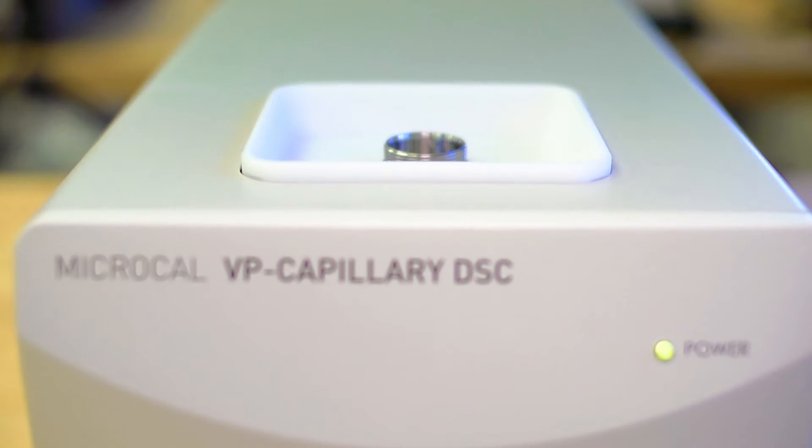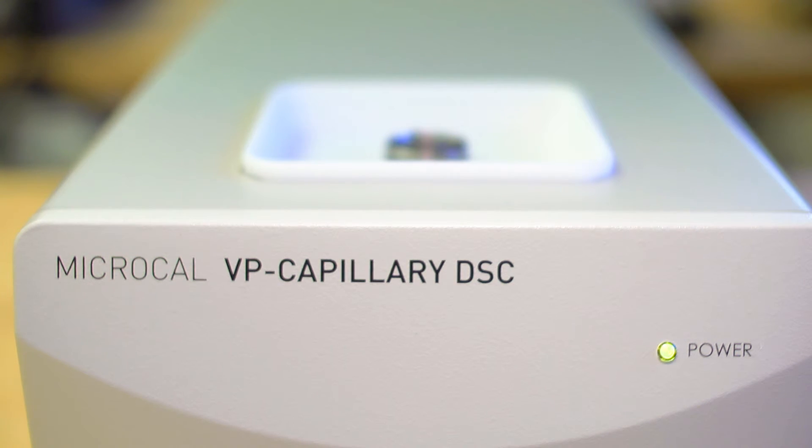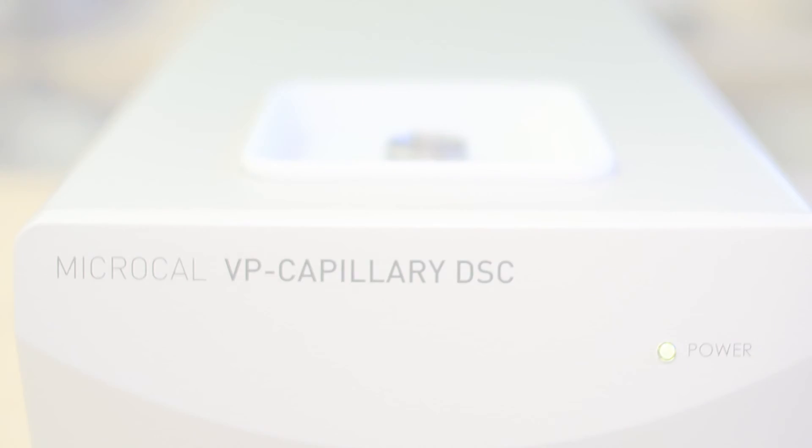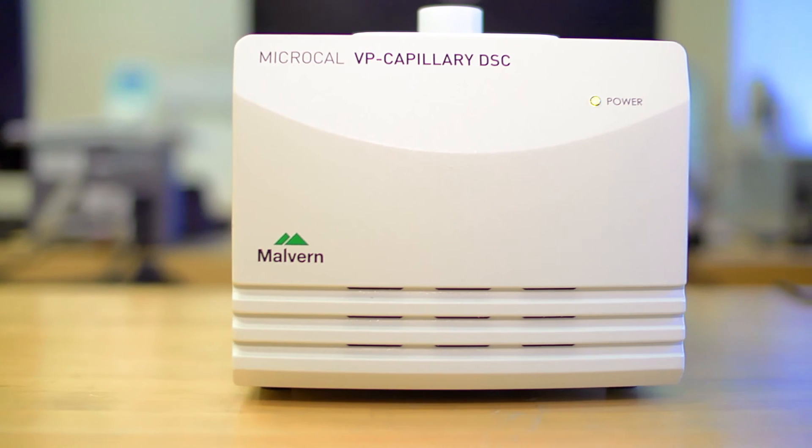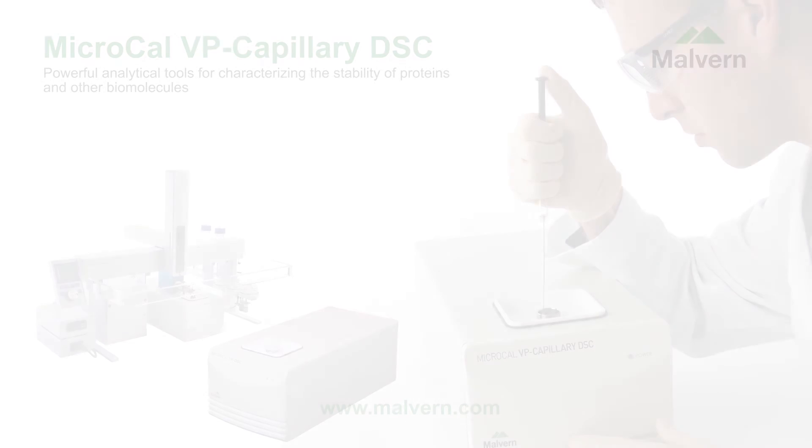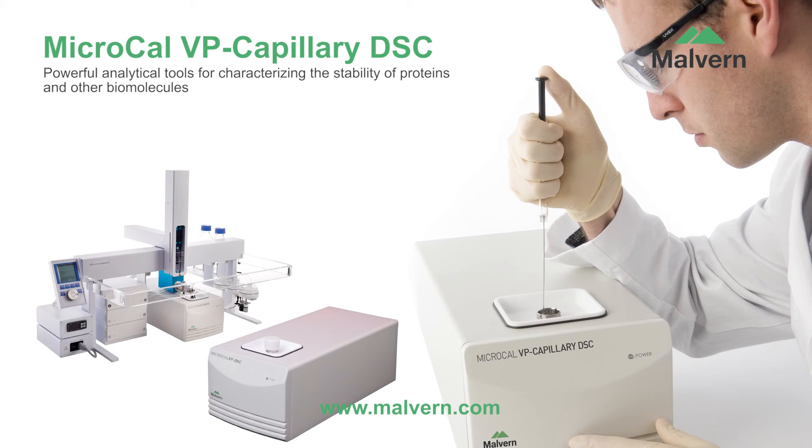MicroCal VP Capillary DSC range will enable more researchers to utilize the powerful in-solution label-free technique of DSC to address today's difficult research challenges. For more information, please visit malvern.com. Thank you.